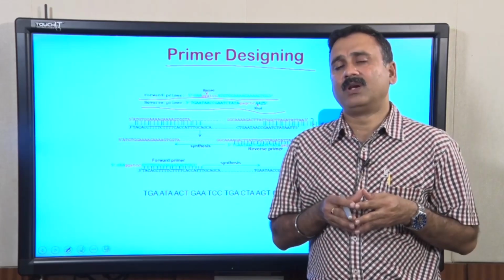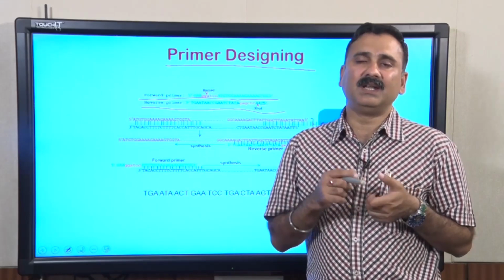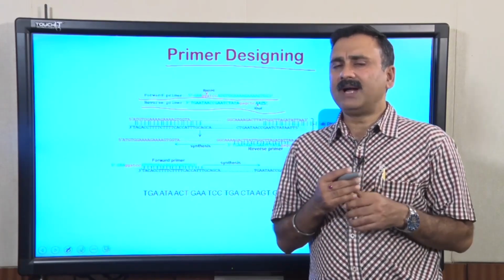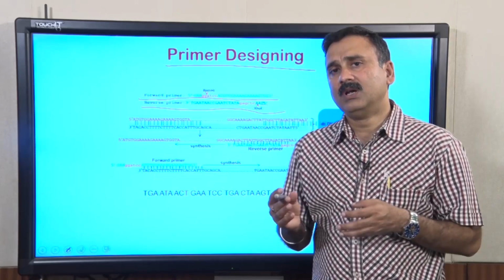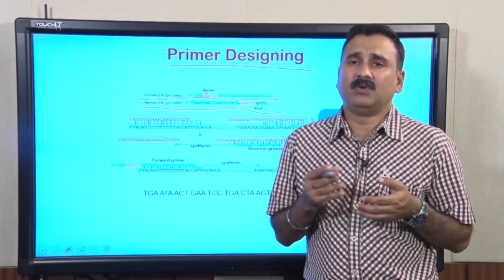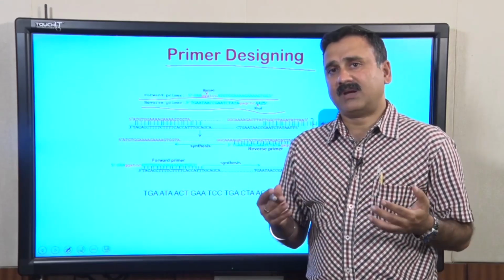If you recall, in our previous lecture we discussed the primer length, primer Tm, annealing temperatures, GC content and GC clamps, and he is going to show you all these aspects with the help of that software. He will also show you the different types of defects you can encounter when designing primers, such as primer dimers or loop formations, and how to get rid of these loops. He is going to give you a demo about primer designing and the analysis of these primer sequences.